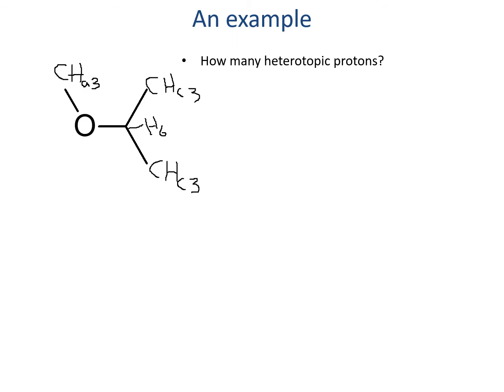If we look at the different protons here, HA is connected directly to an oxygen, but it also has hydrogens attached to it. HB is also attached to the same oxygen, but it has the more electronegative carbons instead of hydrogens. So HB should be the most shifted because it has the most electronegative things attached to it. After that, we'd expect HA, and then HC should be the least shifted. So we should see HB show up the most downfield from 0 parts per million, our reference peak. And then after that, HA and HC should show up the most upfield.